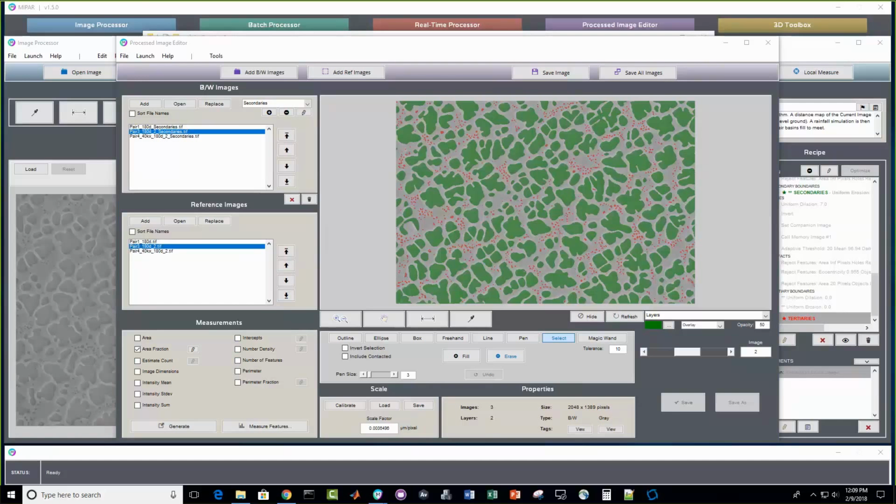So we were just reviewing the questions that came in during the material science section. We have a question from Elias regarding batch processing. He mentions that, at least in his cases, gradients and noise in the background can evolve during acquisition. In principle, one can tune the recipe separately for smaller batches, but is there a way to deal with this dynamically in a single recipe?